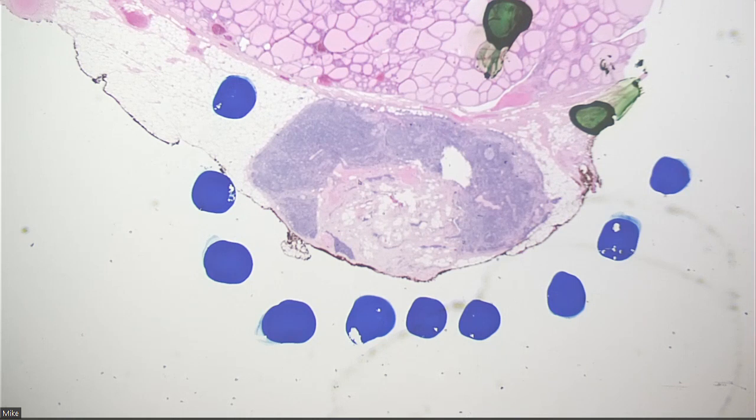And you don't wanna just ignore them, be like, snap, snap, snap, snap, snap, isthmus done. If you see those little nubbins, maybe think about plucking them off separately and submitting them as lymph nodes, because in cases like this, we have found incidental micromets in these little incidentally plucked off lymph nodes that you see at the isthmus.